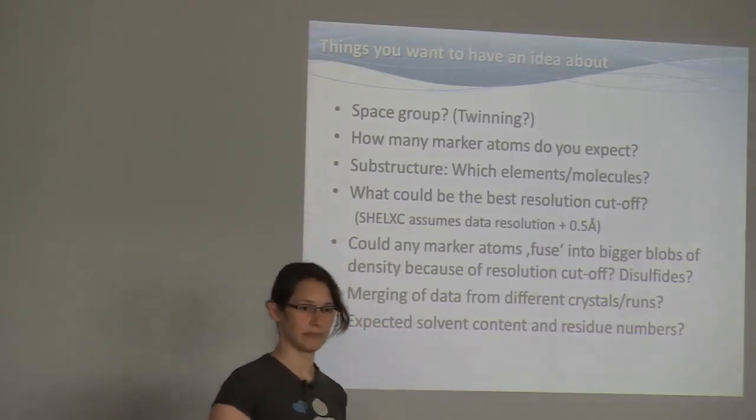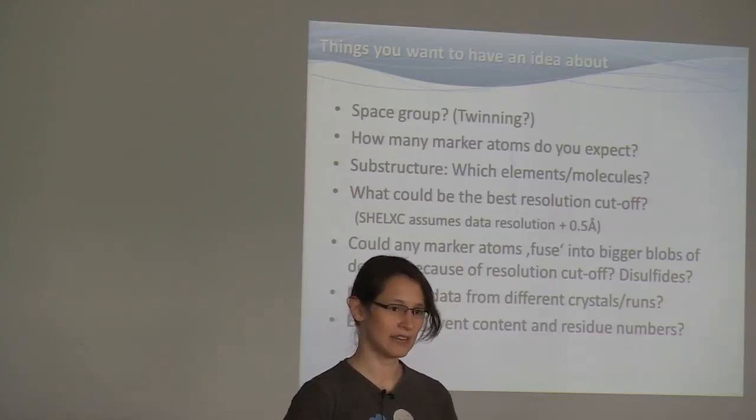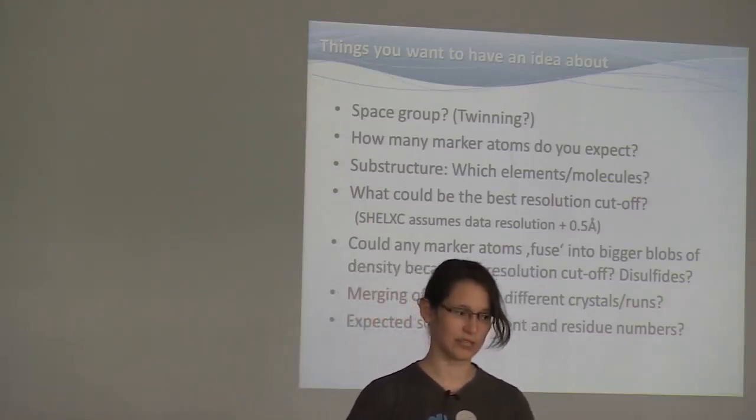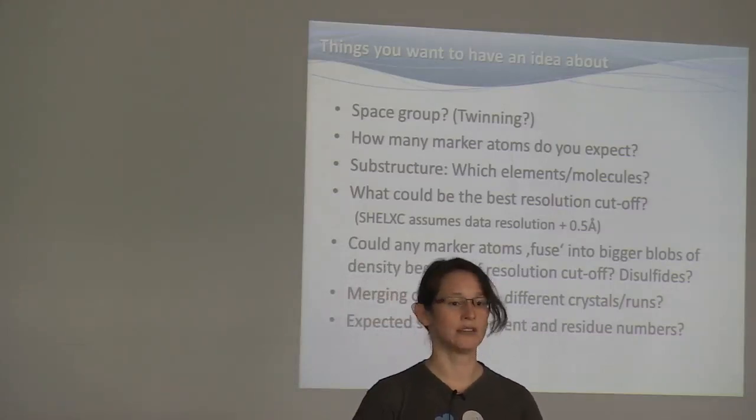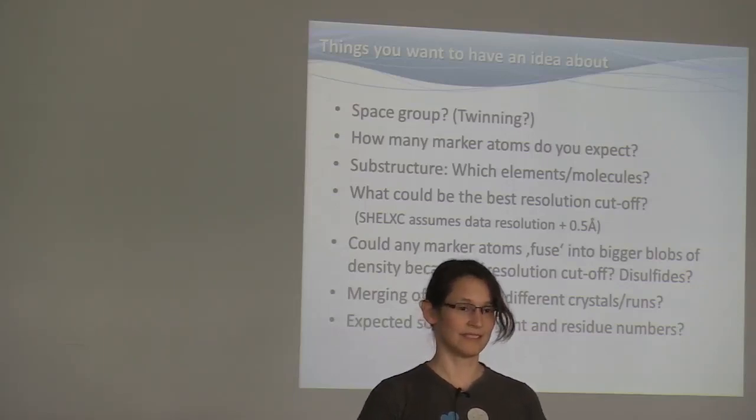Low resolution is important. When do you cut it? If I've done my integration and scaling properly, and I'm confident that my mask was right, I don't cut it at all, meaning I leave a value of 999 in SHELX, and in scaling, I don't give a low resolution limit. Many people tend to cut it at 30 because that takes them out of problems. They're not having issues with the mask.